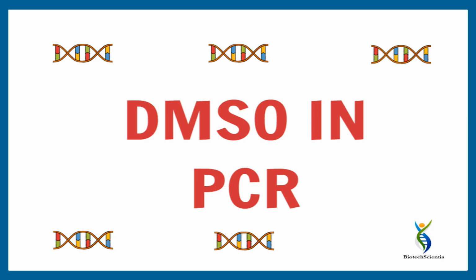PCR, or polymerase chain reaction, is a powerful technique that allows us to amplify specific DNA sequences. But what is the role of DMSO in this process? To find out the answer, stay tuned at the end of the video.